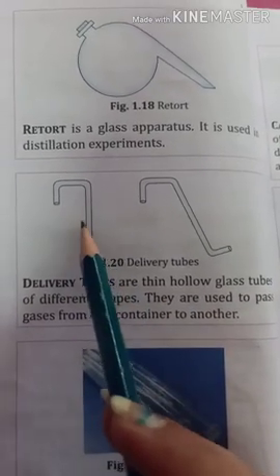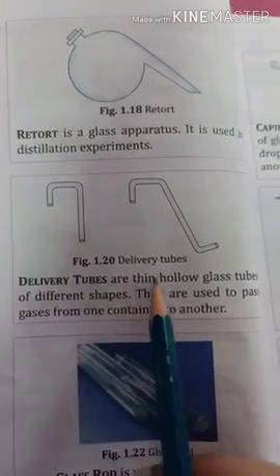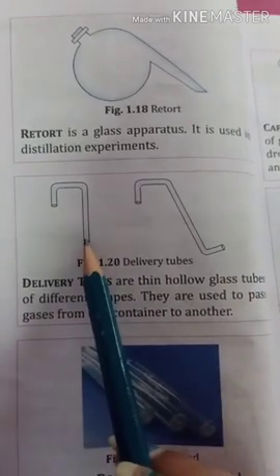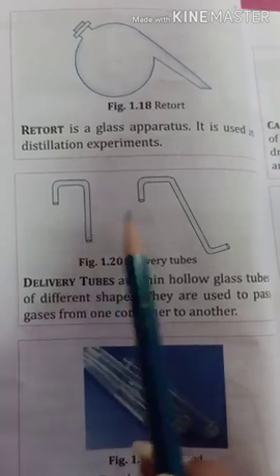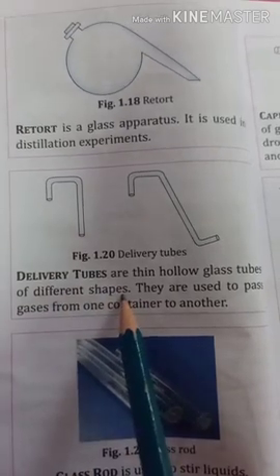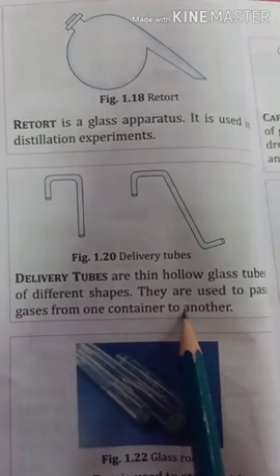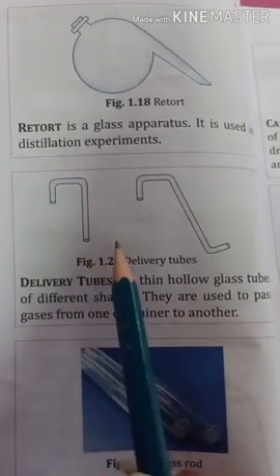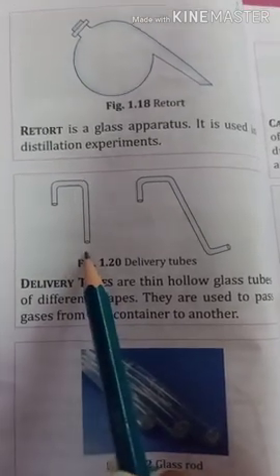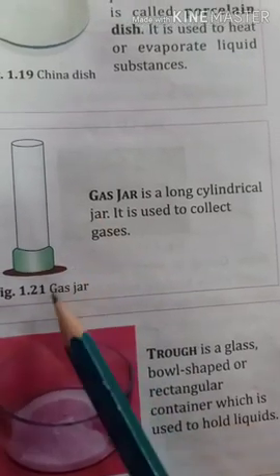Here we have delivery tubes of different shapes. Delivery tubes are thin hollow glass tubes. These tubes are made up of glass and they are hollow tubes of different shapes, and they are used to pass gases from one container to another container.